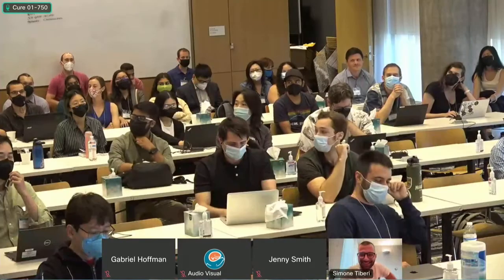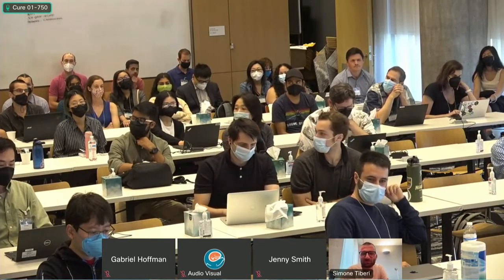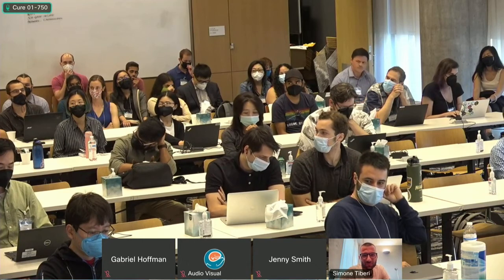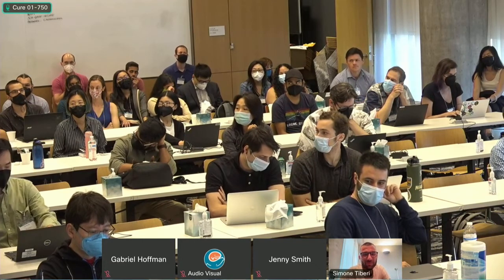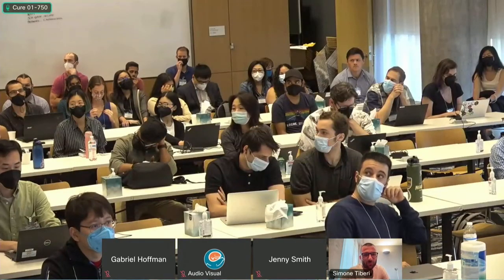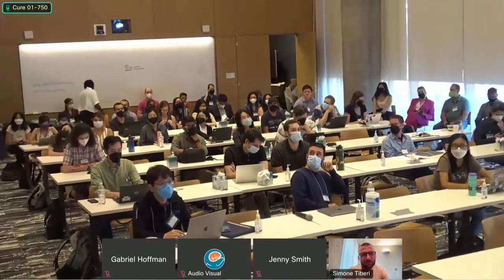I have a question for Simone. You mentioned that you can cluster the cells, but do you do that clustering on just the spliced reads, the unspliced reads, or both combined? Because I know 10x Genomics is now making it default in their Cell Ranger to just count everything. It's better to count them all together.